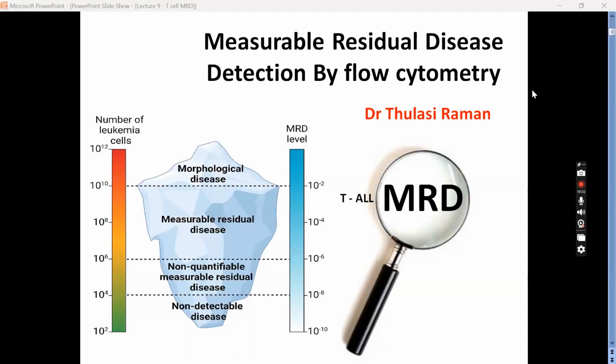Okay, so it's a case of hepatosplenic gamma delta T cell lymphoma. But you also need to know that sometimes CD8 can be negative, still it does not rule out the diagnosis of hepatosplenic gamma delta lymphoma. And similarly, CD16 can be negative, or in rare cases, CD56 can also be negative. So don't think in terms of CD16 and CD56 alone if you get a population, that is the importance of having a good panel. Now, for example, if you want to use a very stringent panel and you are not using TCR alpha beta or gamma delta, and in fact if we are not using gamma delta and alpha beta, we definitely will not use CD57. So then you will be caught up and you may think, what is this case?